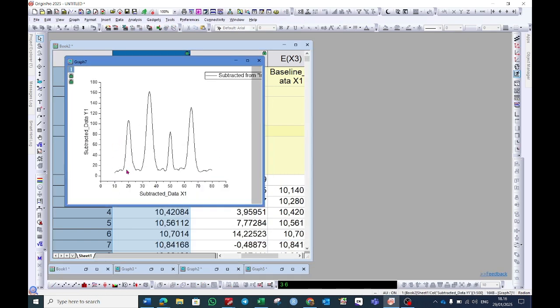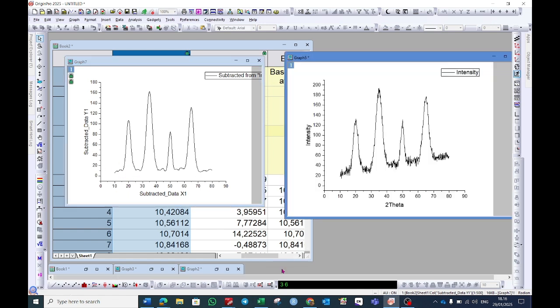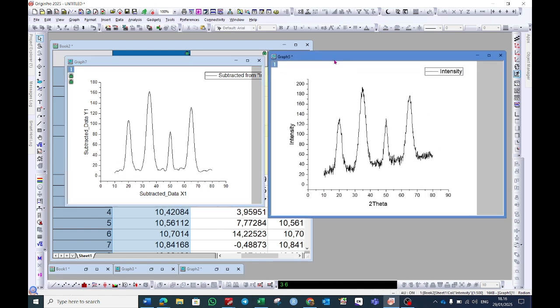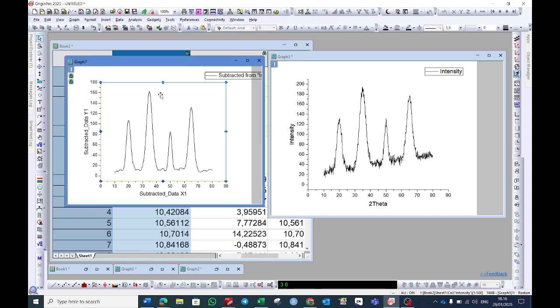In this final curve, the baseline correction is performed and the smoothness is also done. So let's compare with the original graph. Here you can see the baseline correction is not performed, and here the baseline correction is done and the data is also smooth.